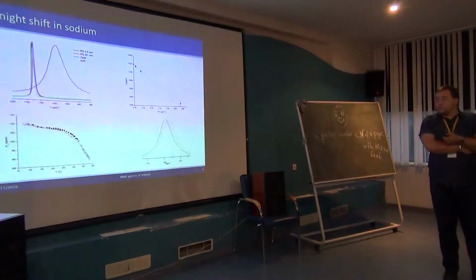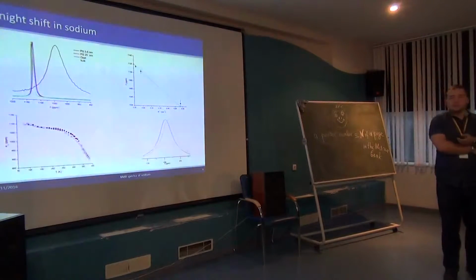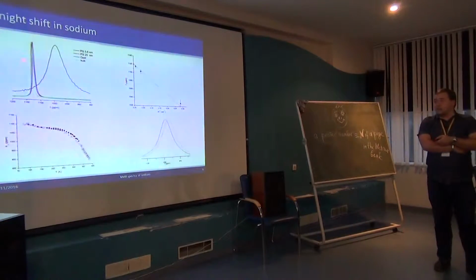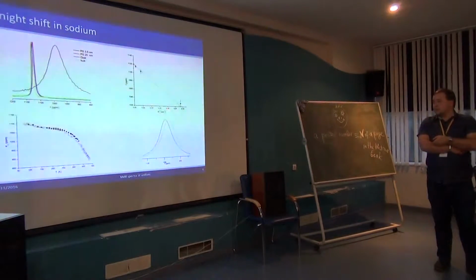And now let's turn to the left line, which is the most interesting for us. As corresponding to the experiments with other liquid metals, the dependence of Knight shift on pore size was observed, and on this plot you can see dependence of position of the center of NMR line on inverted size of the pores.